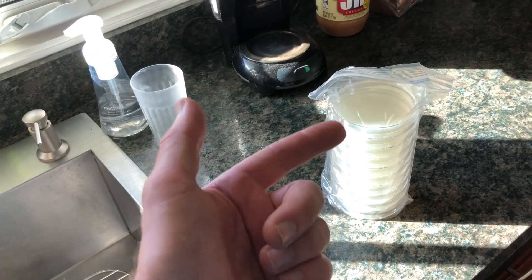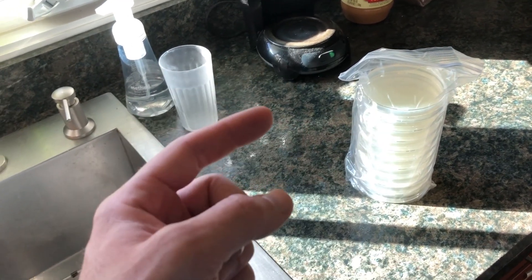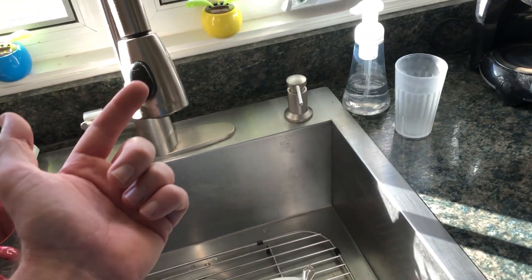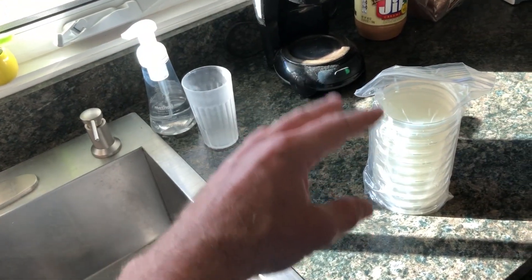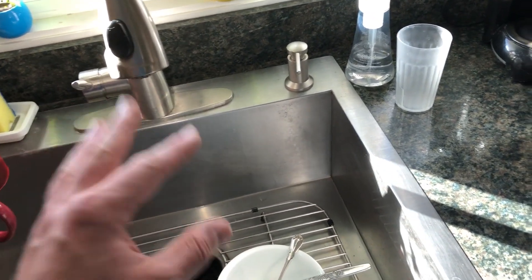We're going to take another plate and I'm going to touch my fingers to it without washing my hands. Another plate I'm going to wash my hands, then go directly from the sink, shake my hands off, and touch the agar plate without touching any paper towels or towels — to eliminate any bacteria that might be on those.